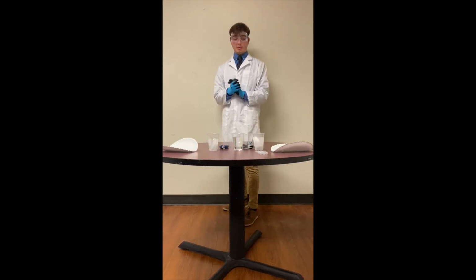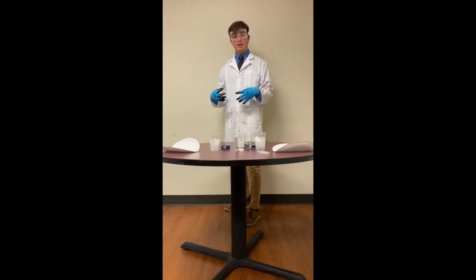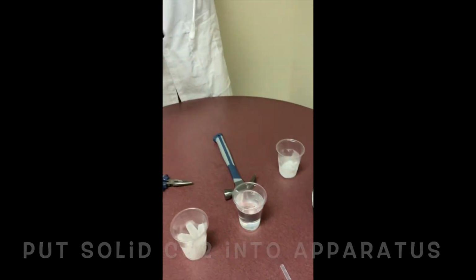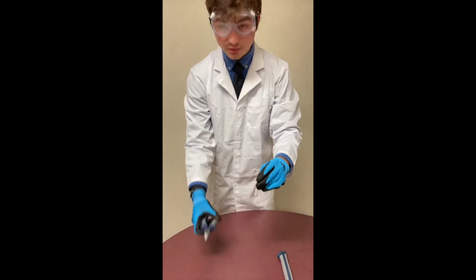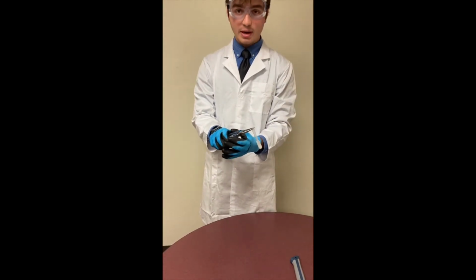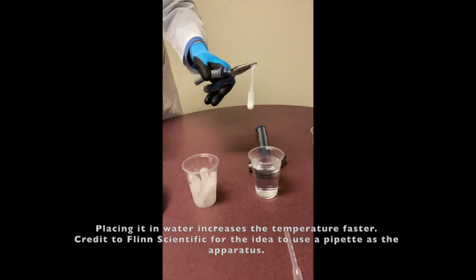So now, what I'm going to do is create liquid CO2 by increasing the pressure as the temperature increases. Next thing we will do is increase the pressure by closing off the apparatus with a pair of pliers for safety, of course, and then we will insert the apparatus into the water to illustrate the pressure increasing and the temperature increase.